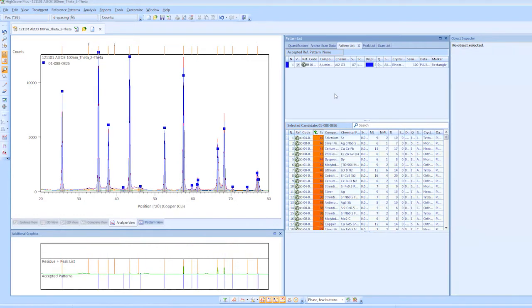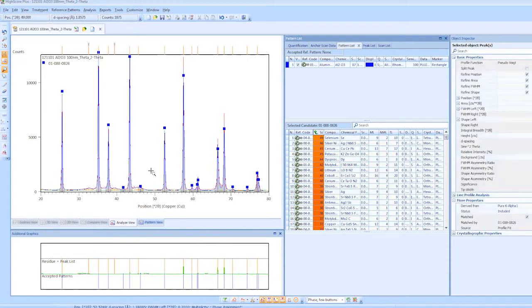Okay. And now this is showing me where all my peaks are. And basically it's got most of them. There may be some smaller ones here, and I doubt that there's actually another phase in here, but it could be. But that's the way you do a very quick match. All right. Then that's the way that you do most everything. So that step-by-step process is basically you just do the background subtraction, smoothing if you want, then the peak search, peak fits, and then finally the match.